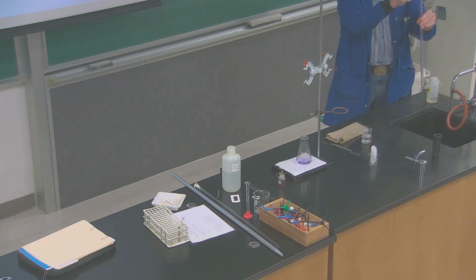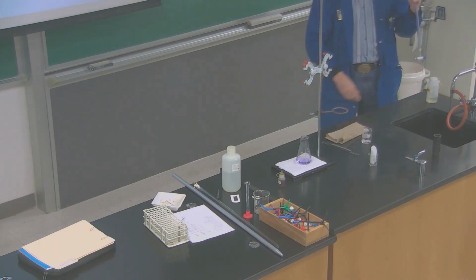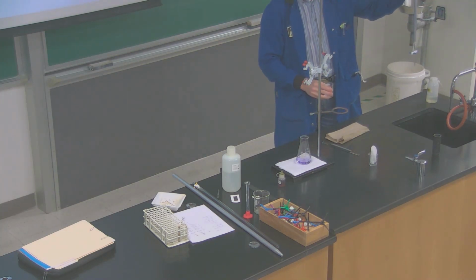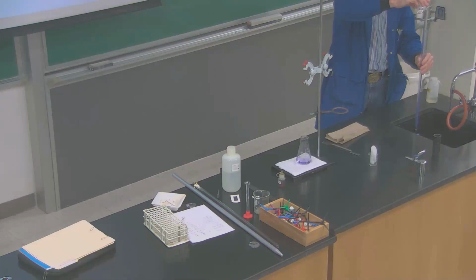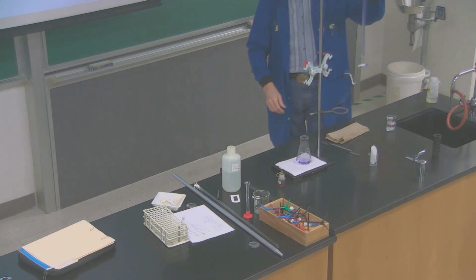If you simply pour acid into a burette that has other stuff, it could react and dilute the acid. Or if you wash it first, it still has water that will dilute the acid. And then you'll want to fill this up with some hydrochloric acid. Doesn't matter, just like with the standardization experiment, you don't have to get this exact. Just get it somewhere close to the top. You'll have plenty in here then.